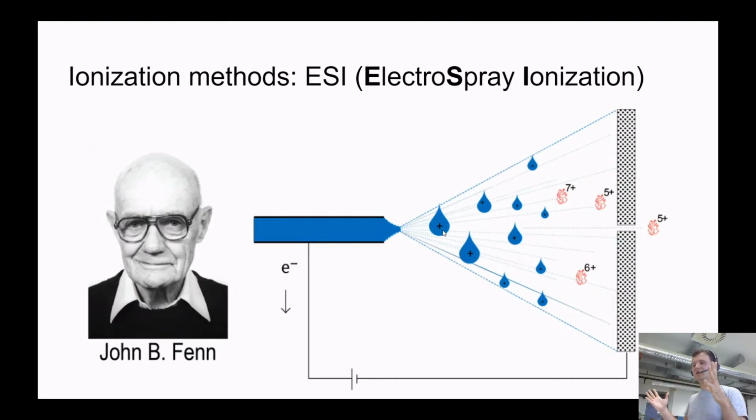But the idea is that this positive charge is somehow transferred onto the peptides or proteins. The evaporation is still going on, and these positively charged molecules are really just disrupting the small droplet with Coulomb force. As a result, at a certain moment, you have individual proteins or peptides which are positively charged. And as you see, we solved the issue of transferring a sample from the liquid phase to the gas phase, and at the same time charging these peptides or proteins.